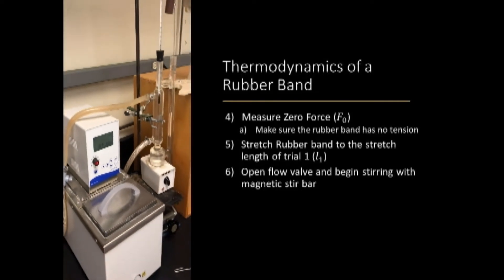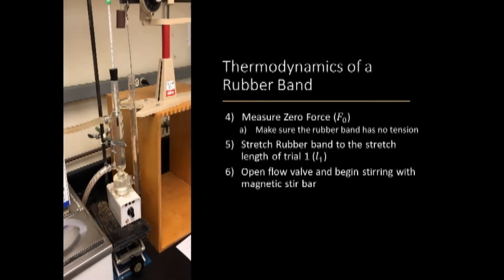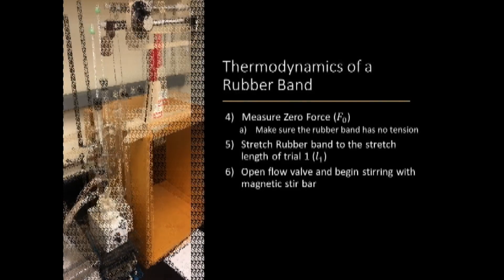Next, you will open the flow valve and begin stirring the stir bar to begin circulating the hot water to heat the apparatus and the suspended rubber band.